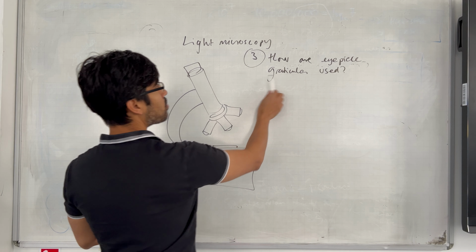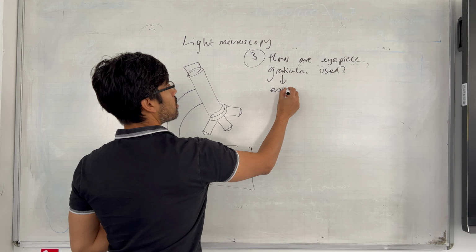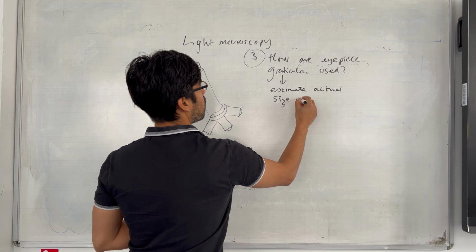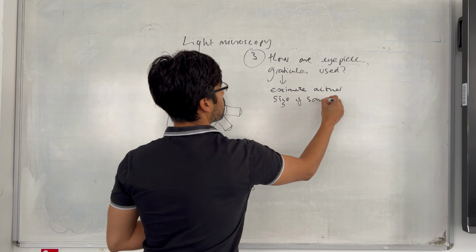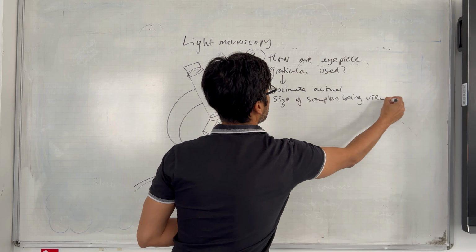The eyepiece graticule, its purpose is to be able to estimate the actual size of samples being viewed.